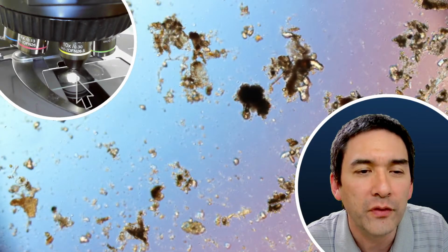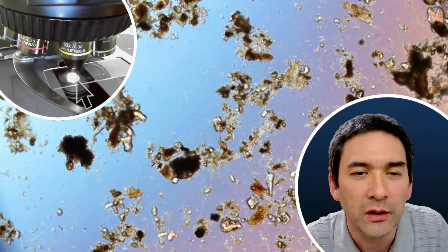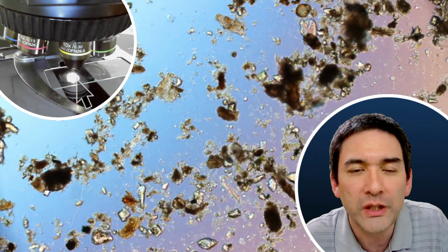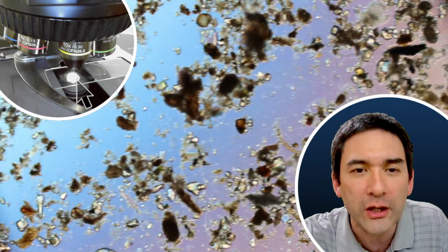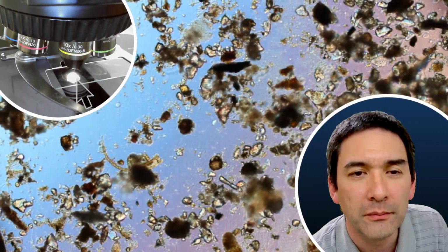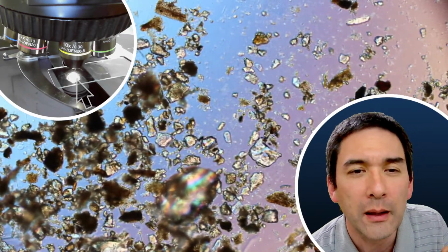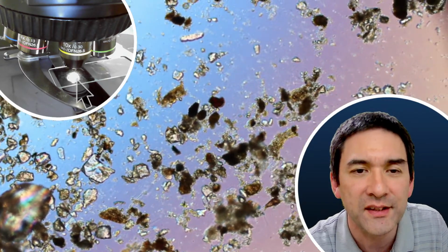And what we have over here is a light microscope, where the light basically passes through the specimen. For this reason, you basically only see the two-dimensional projection. Now, if you have a so-called DIC, a differential interference contrast microscope, then some of the objects will appear a little bit three-dimensional because it looks like they're casting a shadow.